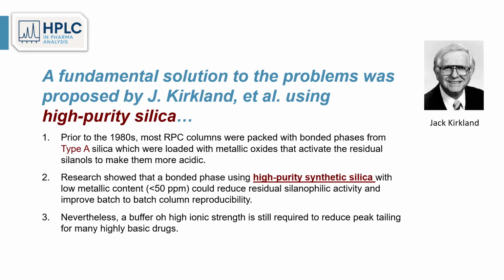A more fundamental solution to the big problem was proposed by Jack Kirkland using high purity silica. Prior to 1980, a lot of the reverse phase columns were packed with bonded phase from what we call type A silica, which was loaded with metallic oxide. Metallic oxide tends to activate the residual silanol group to make them very, very acidic.